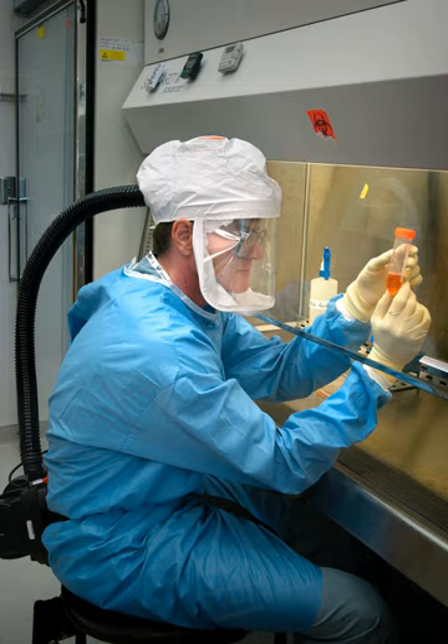Class II principles of operation use motor-driven blowers mounted in the cabinet to draw directional mass airflow around the user and into the air grill, protecting the operator. The air is then drawn underneath the work surface and back up to the top of the cabinet where it passes through the HEPA filters. A column of HEPA filtered, sterile air is also blown downward over products and processes to prevent contamination. Air is also exhausted through a HEPA filter, and depending on the type of Class II BSC, the air is either recirculated back into the laboratory or pulled by an exhaust fan through ductwork where it is expelled from the building.